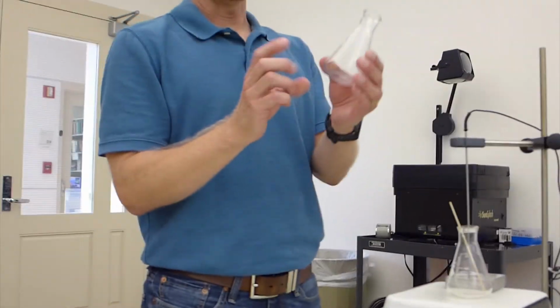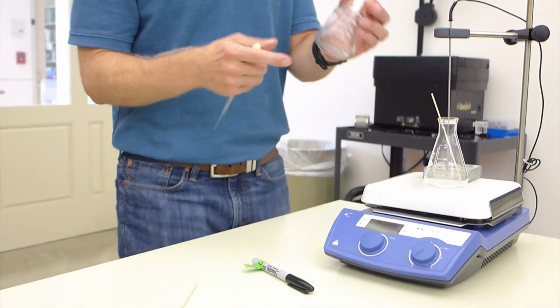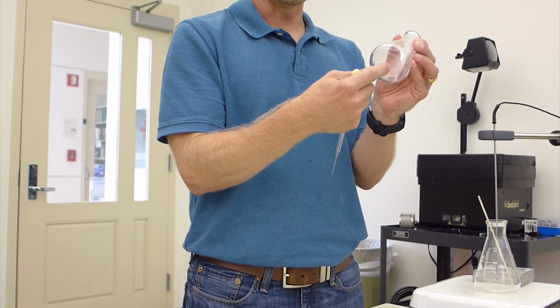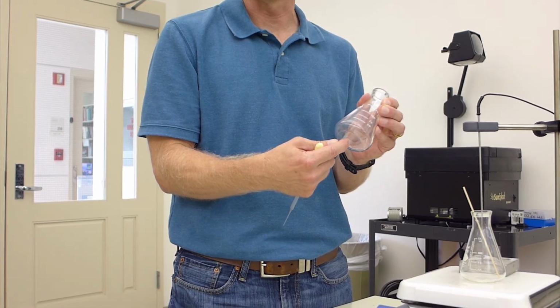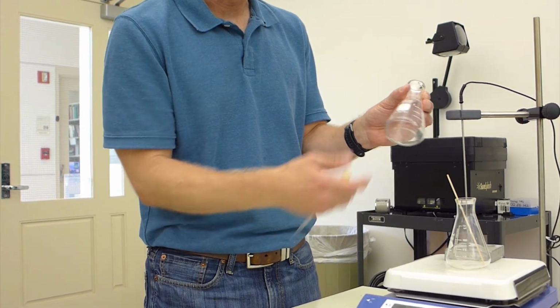Then what you're going to do is you're going to take your crude material and put it in a second Erlenmeyer flask. And we don't want to put this compound without solvent on it onto the hot plate directly, because there's no solvent on there, and so the hot plate surface is actually very, very hot, and you could actually burn the compound before there's any solvent on it. You want it to be dissolved at least a little bit before it goes in there, and you want there to be some solvent present in there.